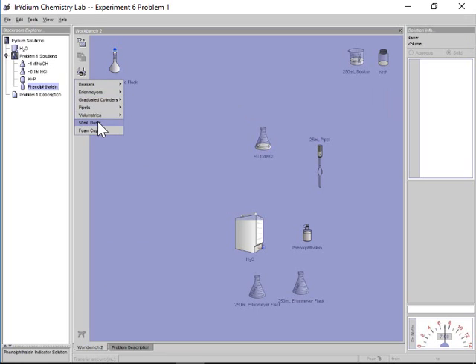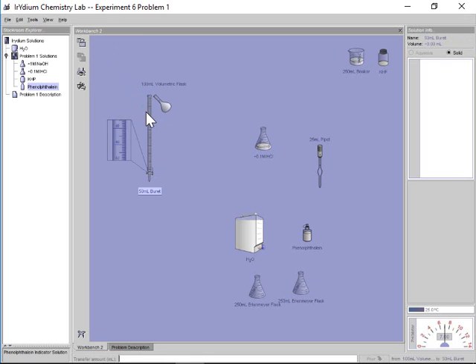Let's pull out a fresh burette or just a previously washed burette here. Fill it in with something more than half. So let's fill it in, let's say with 40 again. Again, this is in a virtual environment. It pretty much is going to be similar for multiple trials, but I'm just trying to mimic if this were in real life, this is what you would have to do. This time I'll make sure to take down my starting reading. My starting reading here was 11.22, right? Plus or minus 0.05. That's my initial starting reading.